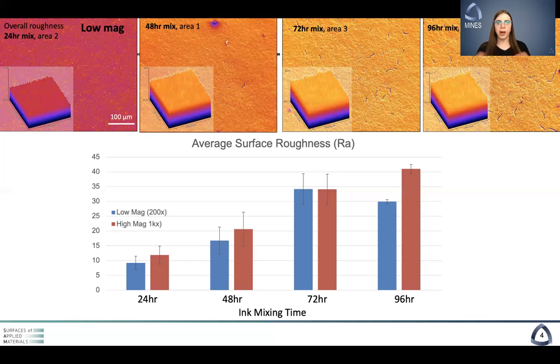And we want to make sure that the roughness of the actual layer is increasing, because that's the important thing that gives us surface area and thus catalytic activity. If the only reason it's increasing is because it's getting more cracked, because cracks also are a form of roughness, that's not particularly helpful to us. And obviously something we need to know, because we would actually prefer fewer cracks for ideal performance.